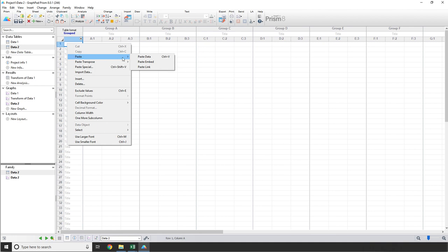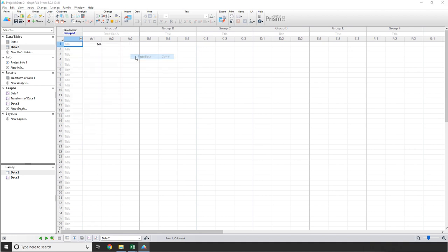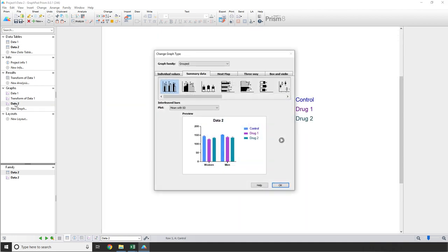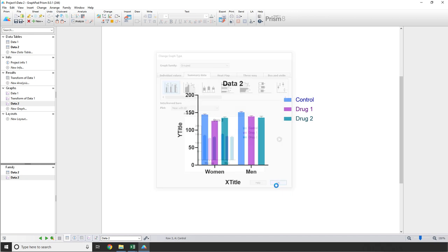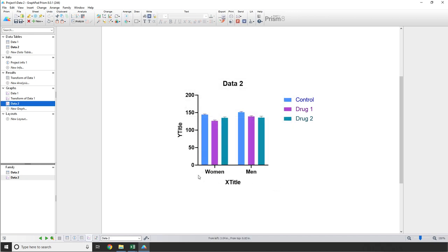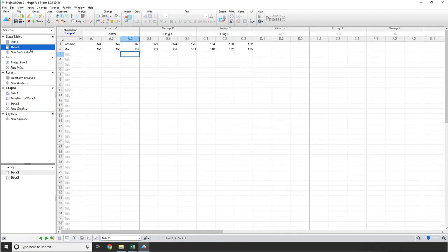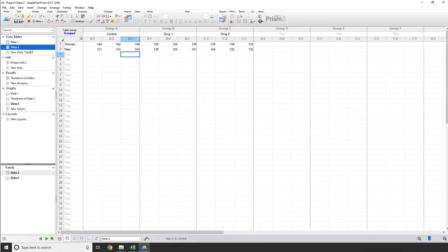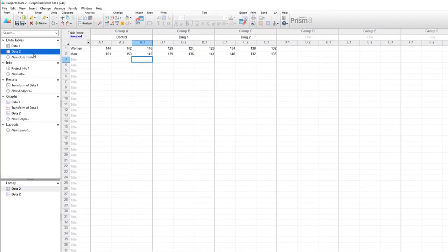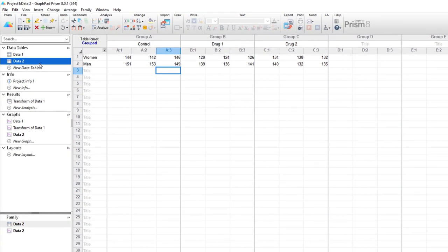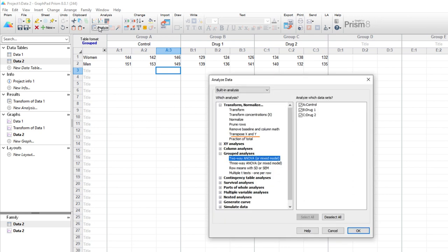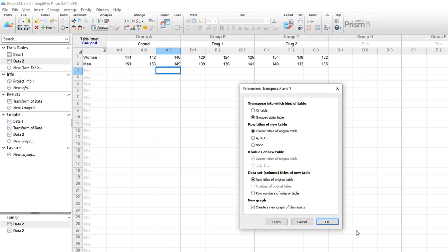We'll create a new data table, make it grouped, with three replicate values. Then we can paste in our data and look at the graph. In a previous video, I talked about how for grouped graphs, colors identify data in columns as shown here with Control-1, Drug-1, and Drug-2, each with unique colors. But what if instead, we wanted to use colors to identify bars for men and women? We'd need to rearrange our data table so that rows become columns and columns become rows. In other words, we need to transpose our data. So to do this, we go to Analyze, select Transpose X and Y, and click OK. In the Parameters dialog, we want to make sure that we're making a group data table, the new row titles will be the old column titles, and the new column titles will be the old row titles. Make sure Create New Graph is checked, and click OK.